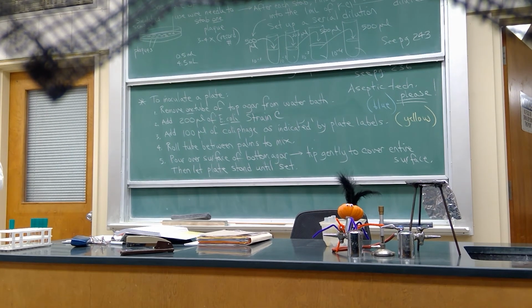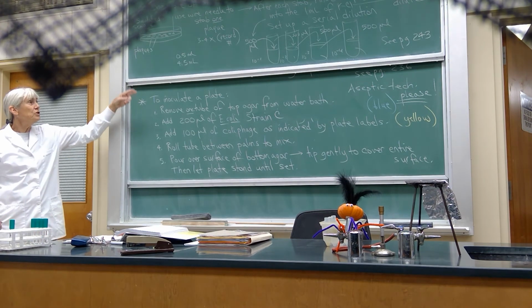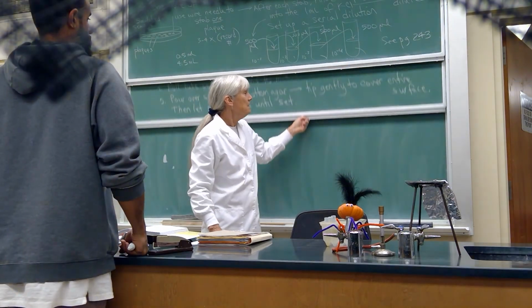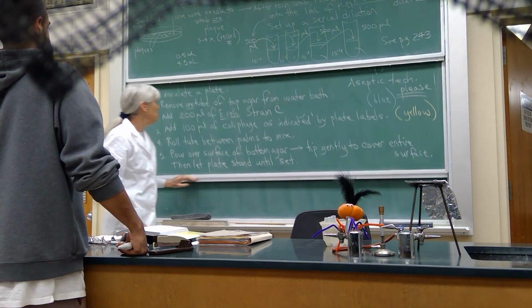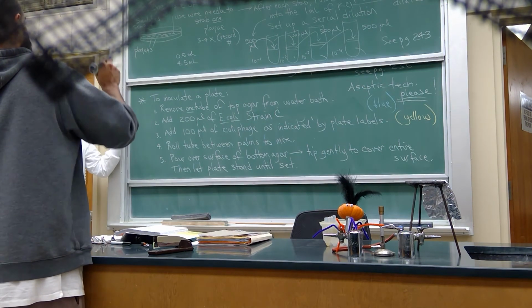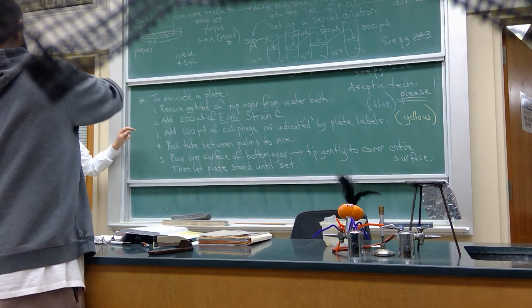Somebody takes their phage and squirts it on the plate. Don't do that. Your phage goes in the top agar. From your dilutions here, even though I drew the arrow pointing to the plates, they're going to end up on the plates, yes, but you do not squirt them on the plates. You put them in the top agar. Always inoculate your plates. Sorry, we don't have enough. We have to boil more agar.